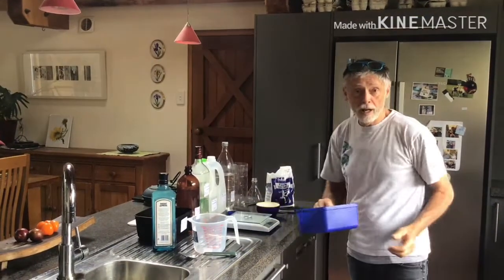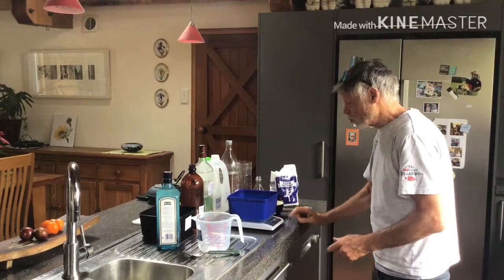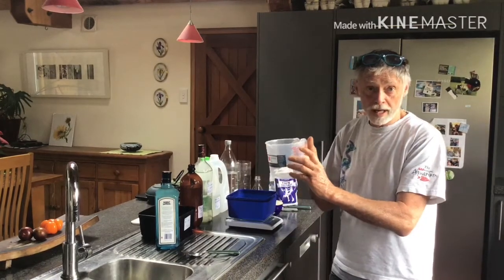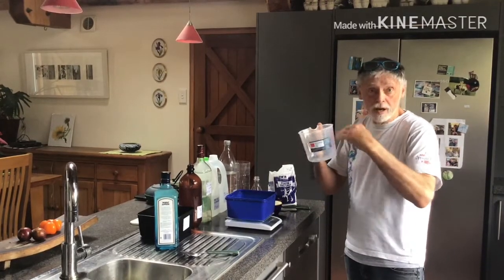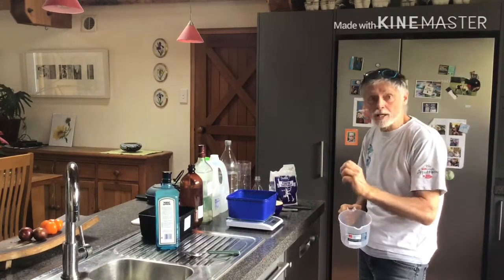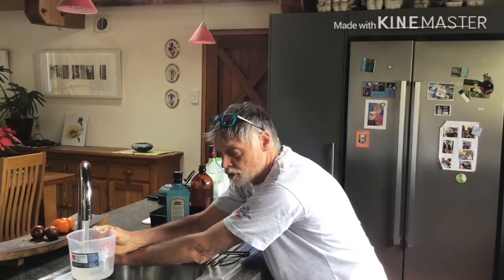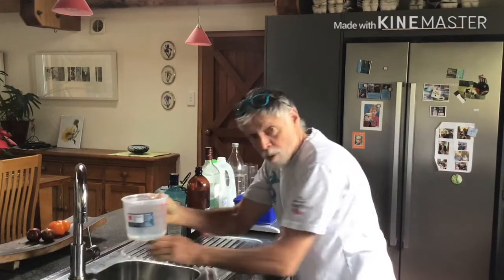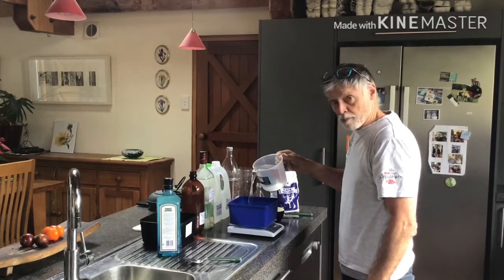I'm just going to make up my last solution, which is 5 parts per thousand. And just a reminder, we're talking about precision. It wasn't very precise using volume to get our litre because of that variation and error around measuring the volume. It's a lot more precise to actually use weight, so that 1,000 grams should be much closer to our litre measurement, our 1,000 mils, than if we were to do it purely by volume.